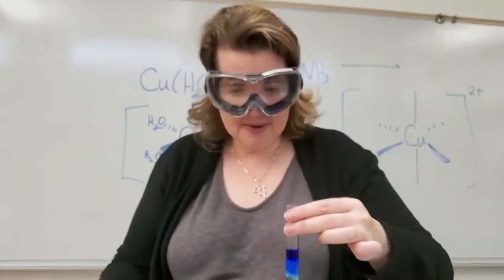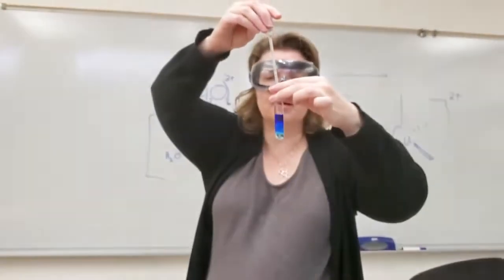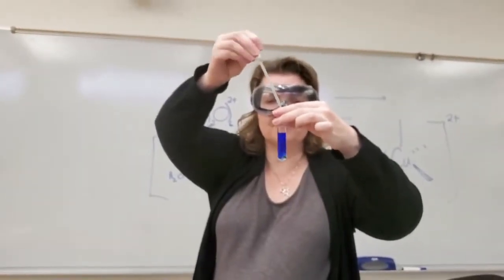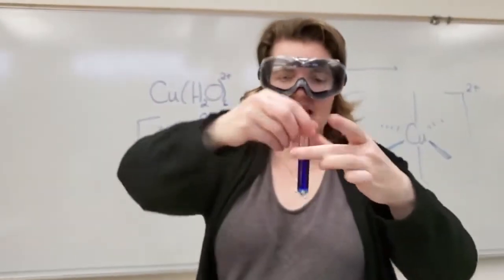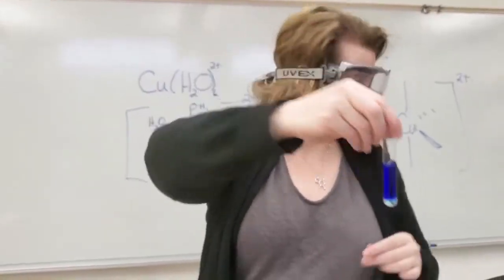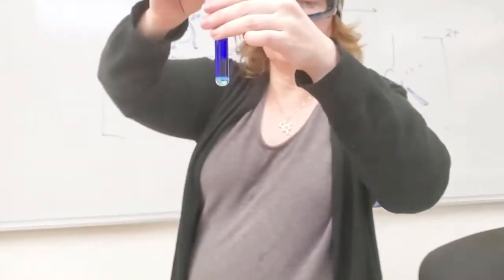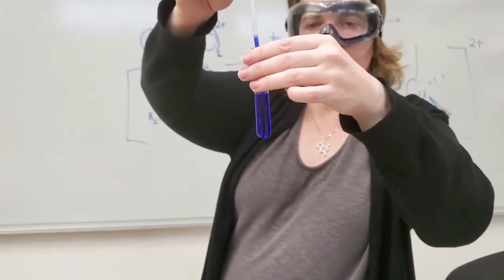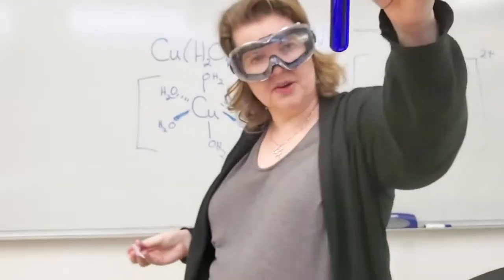I'm going to go ahead and let's just really push this all the way. We're just going to add a bunch of ammonia and really send it all the way to the right. Get that all mixed up in there. There we go. It's a nice cobalt color.